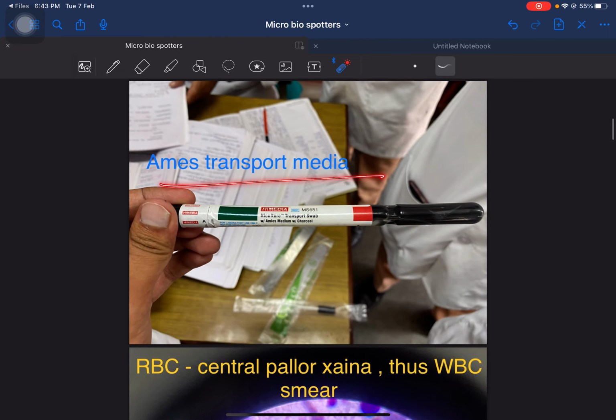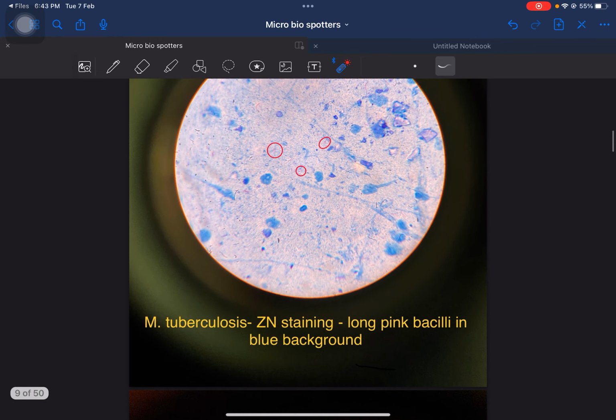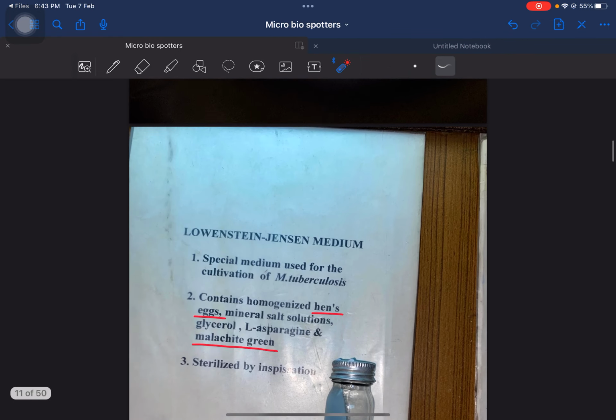This is Amies transport media. These are for the second semesters.